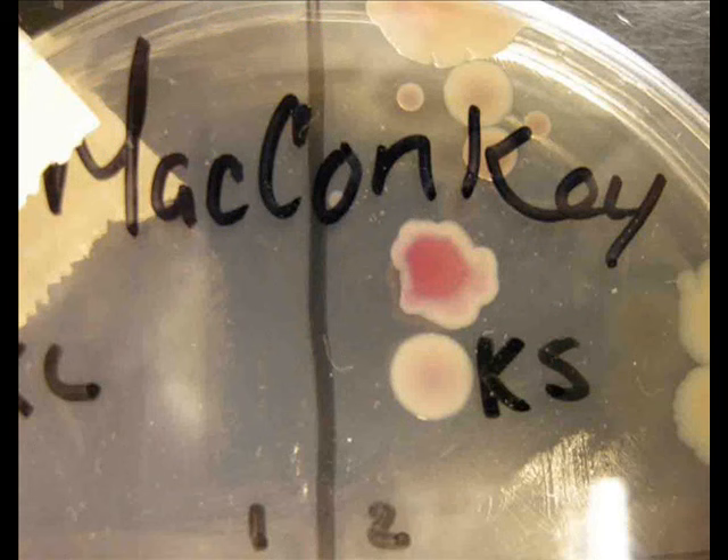On this plate, you can see a Gram-negative colony of lactose fermenters. It's the pink colony with the irregular edges directly beneath the word MacConkey's. The other colonies on the plate are colorless — those are Gram-negative non-lactose fermenters — a nice side-by-side comparison.